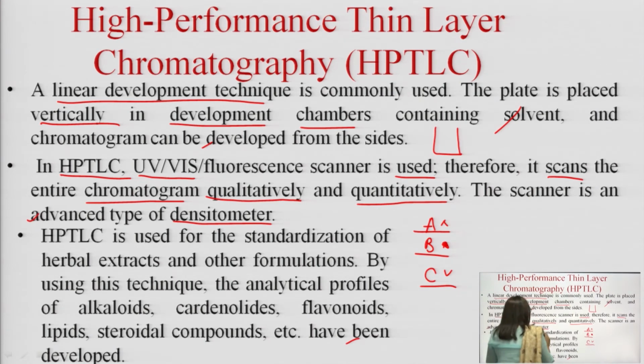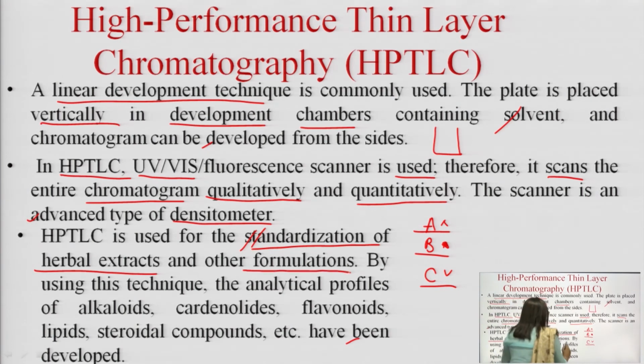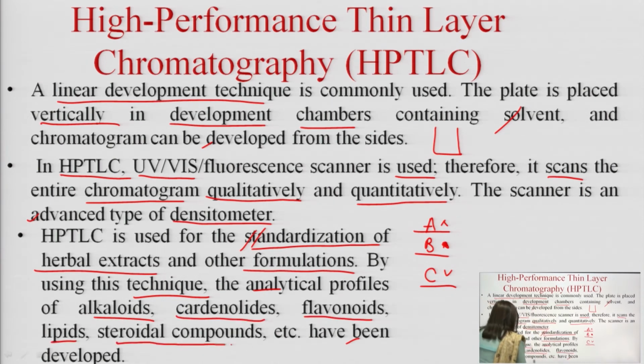HPTLC is used for standardization of the herbal extracts and other formulations. That's why this technique is now being incorporated in IP and other official pharmacopoeias for the fingerprinting assessment and standardization of the herbal medicines. Using this technique, the analytical profile of alkaloids, cardenolides, flavonoids, lipids, steroidal compounds, etc. have been developed.